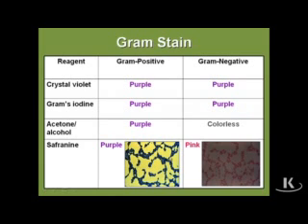Certainly, though, what's important to know is that the Gram-positive organisms will stain purple, okay? If you look down here, the Gram-positive organisms stain purple, and the Gram-negative organisms, as we talked about earlier, cannot retain that crystal violet in the peptidoglycan, so they counterstain with safranin. Therefore, the Gram-negative organisms are pink, okay?